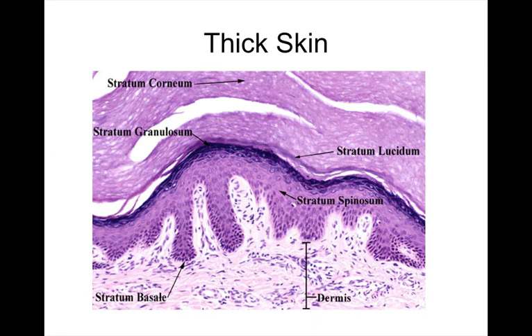Yeah, I buy that. It's interesting. Here, stratum lucidum is usually light in coloration. This is a little bit unusual in that you get kind of a darker stripe here, but I buy that for being the stratum lucidum. It's in the right place. Here, what the stratum granulosum, this is where your lamellated bodies, the little vesicles of prekeratin, that's what's picking up the stain there. That's why it has that really dark appearance.